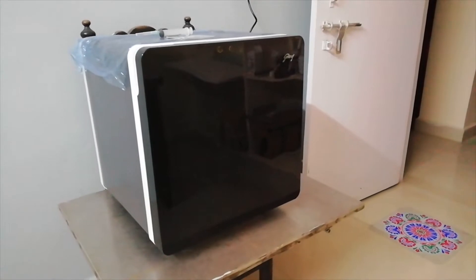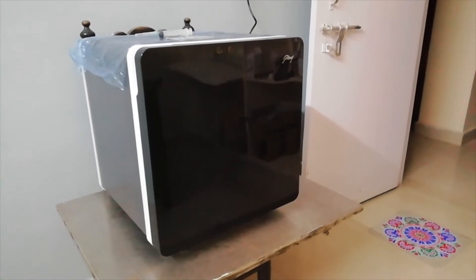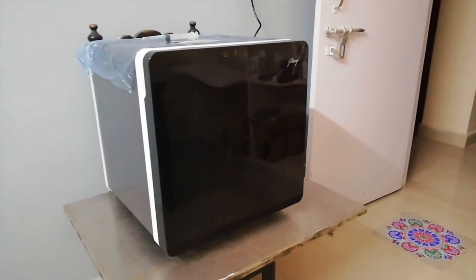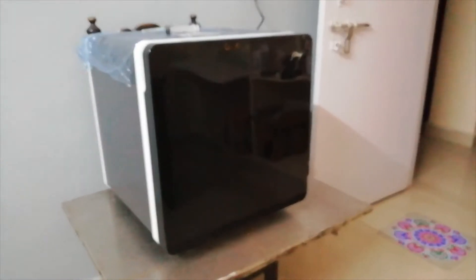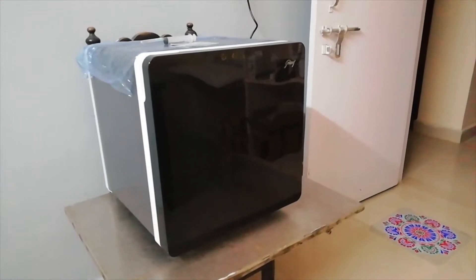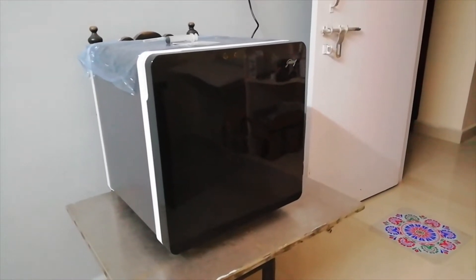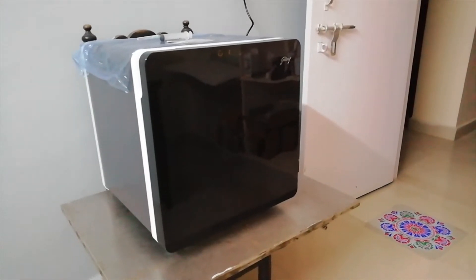Hi friends, this is Ranga from RR Mushrooms. Today I would like to show you how to set up a homemade BOD incubator. This is a small refrigerator that I am converting into a cool BOD incubator.